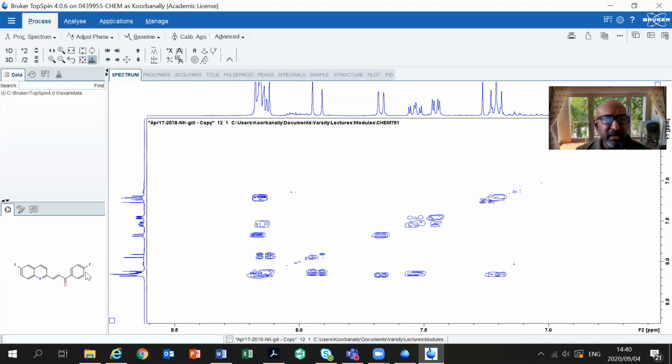I'm jumping to this aromatic ring here because I know in this particular case, I've got a fluorine atom that will couple each of these protons here, right? With a large coupling constant of about 8 Hertz. And next to these protons are also these two protons that are equivalent, which will also couple with a large coupling constant of about 8 to 10 Hertz. So I'm looking at two very large coupling constants coupling these two protons that I'm seeing here.